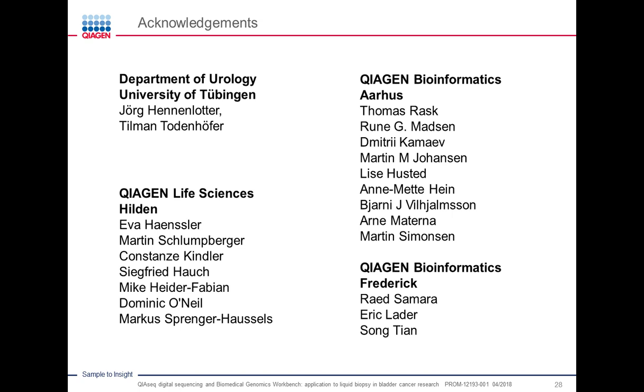Our next question is, how does the Biomedical Workbench integrate with IVA or QCI? So this I only briefly mentioned during the presentation. The Workbench has two plugins that connect directly with the interfaces of IVA and QCI.